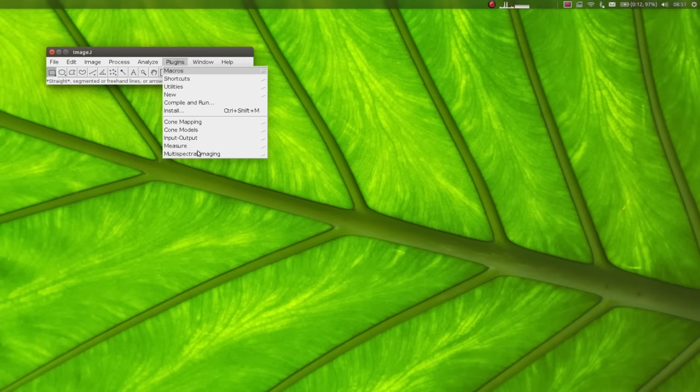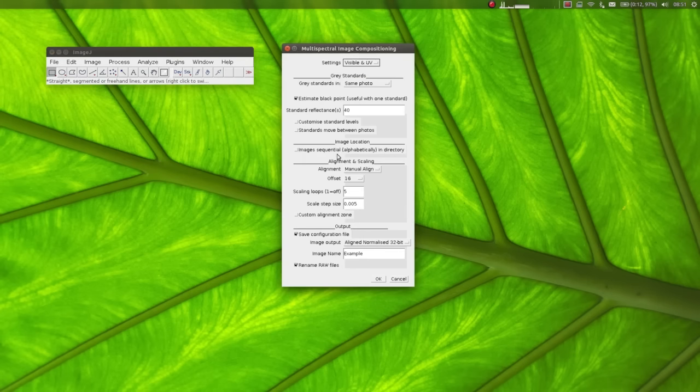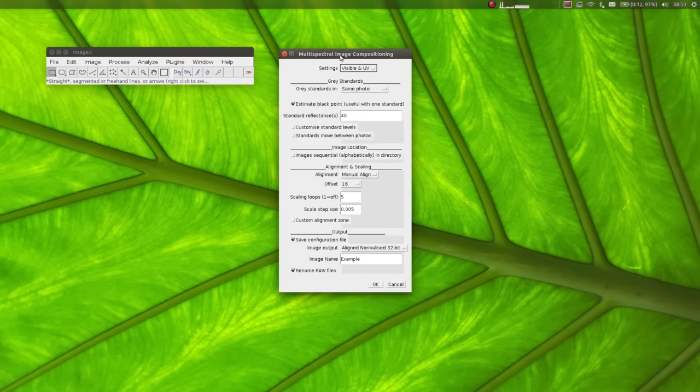To do that, click Plugins, Multispectral Imaging, and Generate Multispectral Image. This will bring up a load of options. First, you need to select the camera and filter setup that you have. If I were just measuring a normal standard human visible red, green, blue image, just select visible here. But here I'm combining a visible and a UV image, so I'll select that.